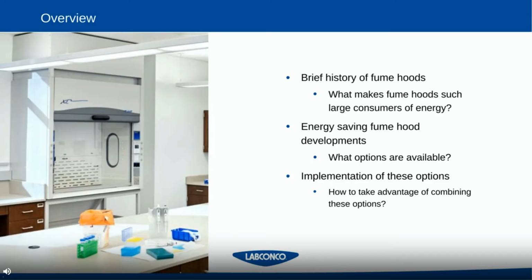Today, we will be talking about the following subjects. We're going to discuss the brief history of fume hoods, where they started, how they've come along, and how they've gotten to where they are today. The energy savings developments that are available in fume hoods and how we've come to those, as well as the implementations of these options. Sometimes it's beneficial to have more than one energy saving option for your hoods or your building. So we'll be discussing all of this through this webinar, but we're going to start with the brief history of fume hoods.